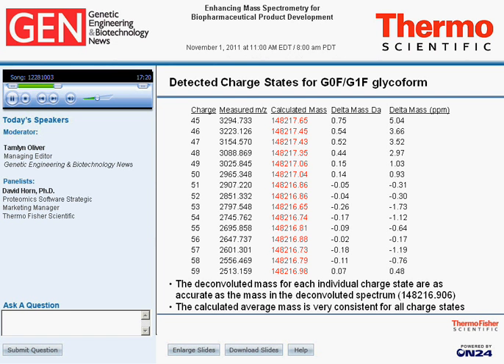What we were also surprised to see was that the mass deviation for each of those charge states hardly deviated from the mass we had from the deconvoluted spectrum itself. That means you can take any one of those individual peaks from this spectrum and use it as the deconvoluted mass, and there's basically no difference from the deconvoluted spectrum. That's a testament to how nicely shaped those peaks are in the raw data and how well resolved they are. Next slide, please.